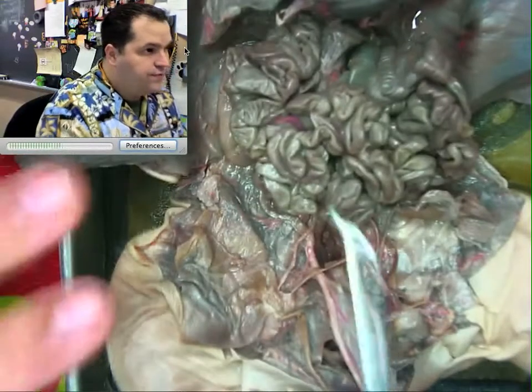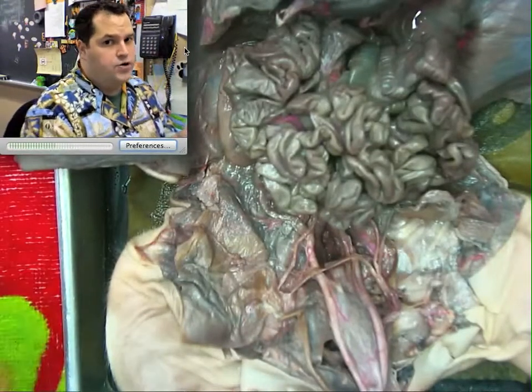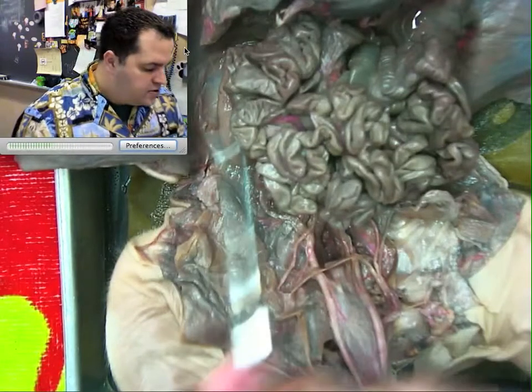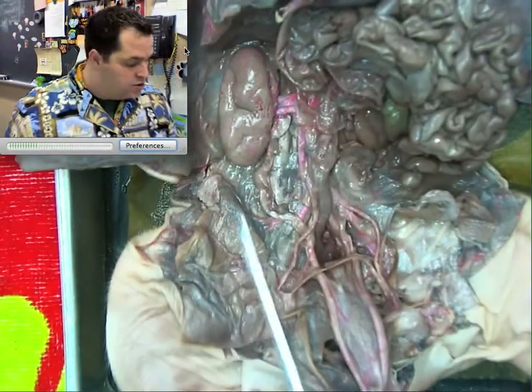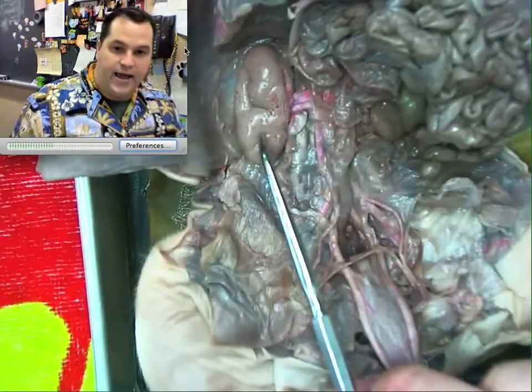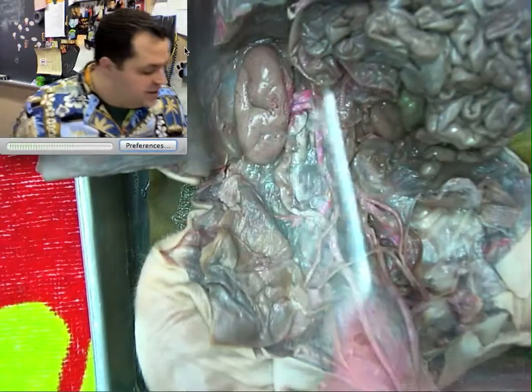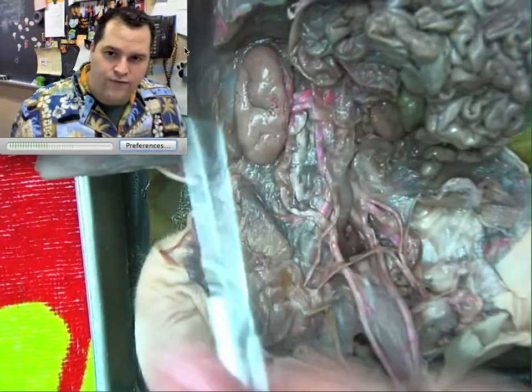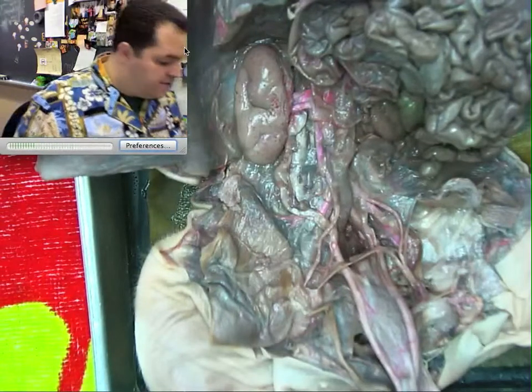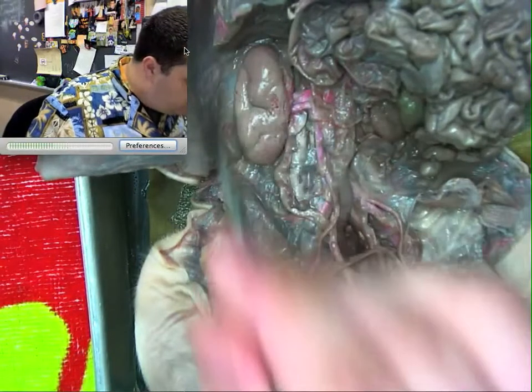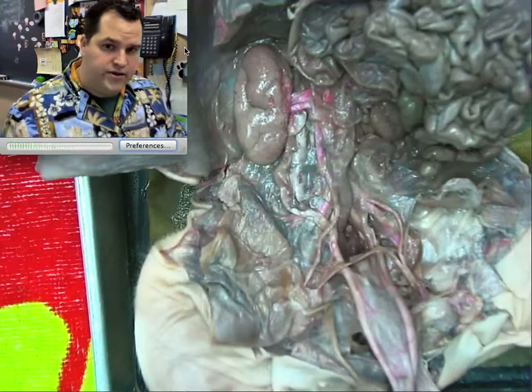Just to give perspective: the small intestine is here, the large intestine is over here, and that's the liver. If I zoom into the lower area — I've already done the dissection, so we're really just identifying. To find the kidneys, I have to lift because they are very, very dorsal, very close to the back. Lifting the small intestines, you'll find this large bean-shaped structure — that is the kidney. In its natural state it was covered with a very thick membrane because it's outside the abdominal cavity, but I've removed that and isolated the vessels.